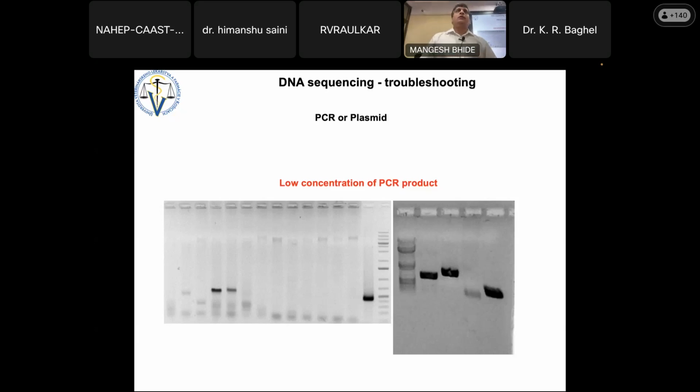Yeah, actually, smear DNA or smear whatever you get, there are again 2 or 3 causes. First one, your DNA is degraded by your hands. So, for example, main thing is rice. If you eat rice and dal with, of course, the hand, and rice has a lot of these DNases by default.